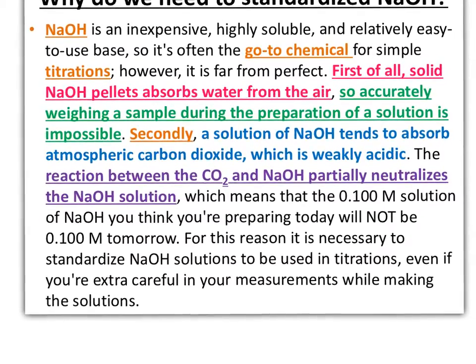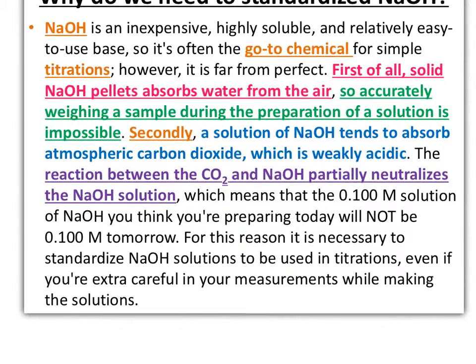NaOH is an inexpensive, highly soluble, relatively easy to use base. It's often the go-to chemical for simple titrations. However, it's far from perfect. First of all, solid NaOH pellets absorb water. So if you're starting with solid NaOH and you dissolve it to form your base, could it have potentially absorbed a little bit of water before you created your solution?